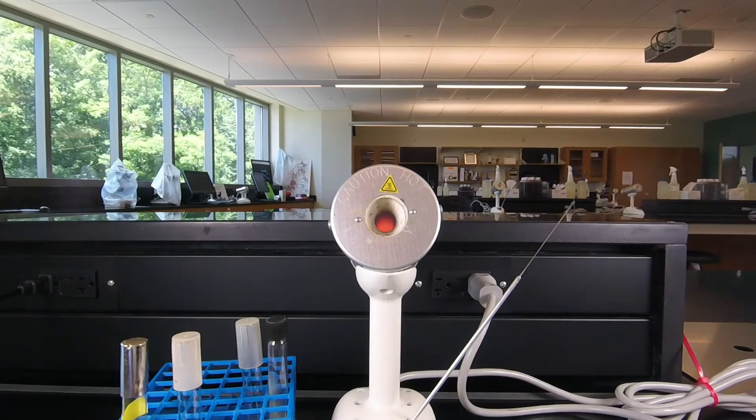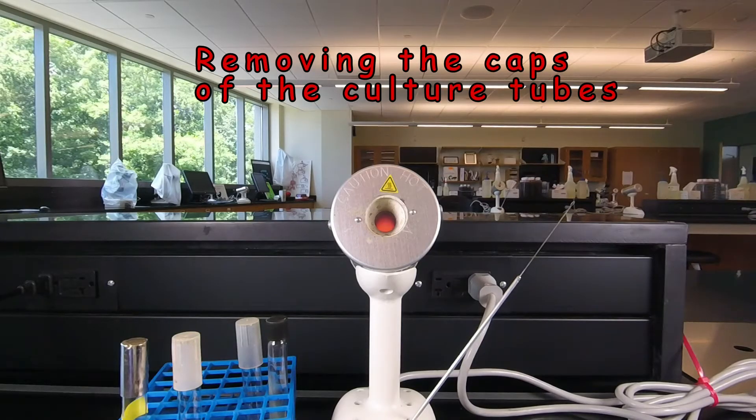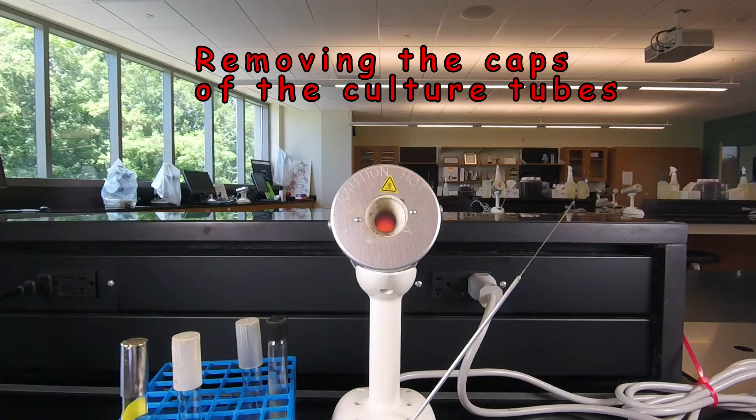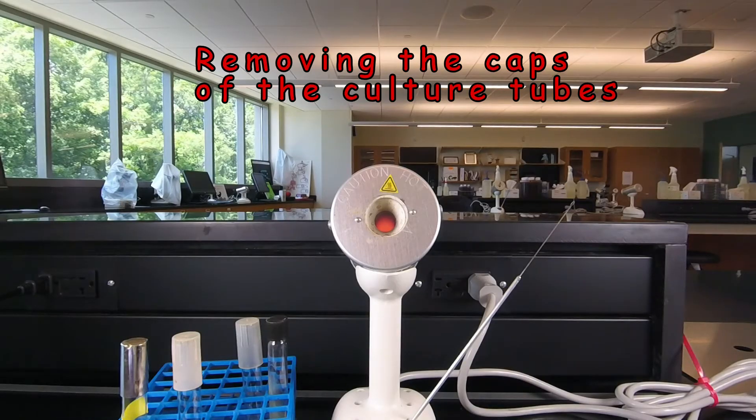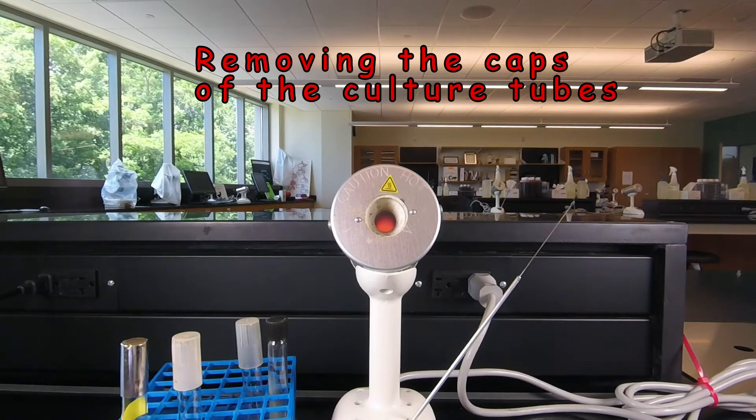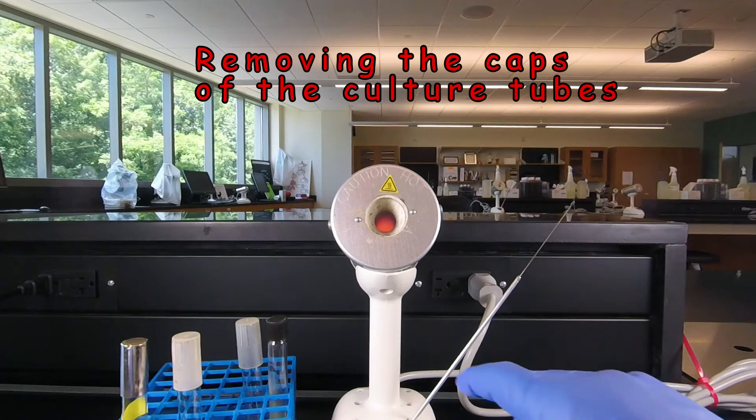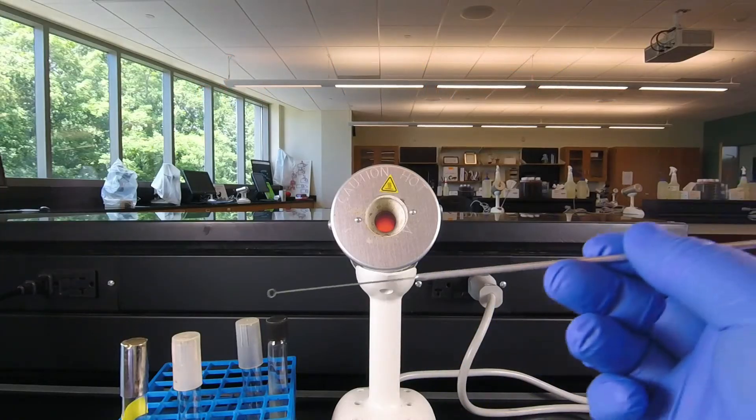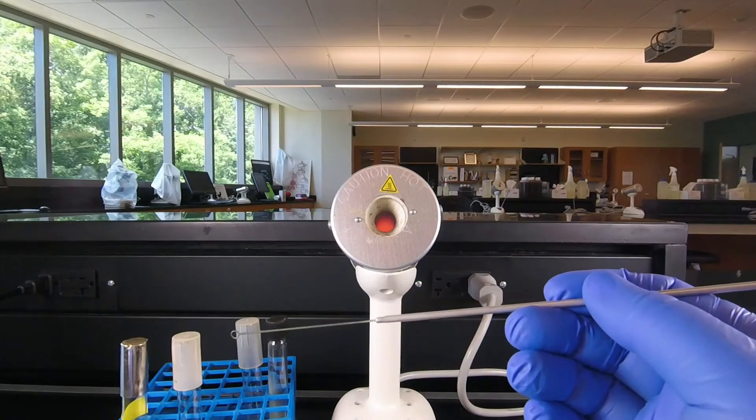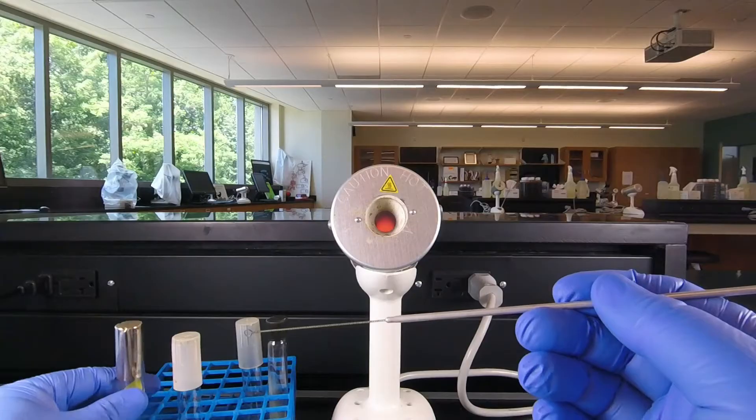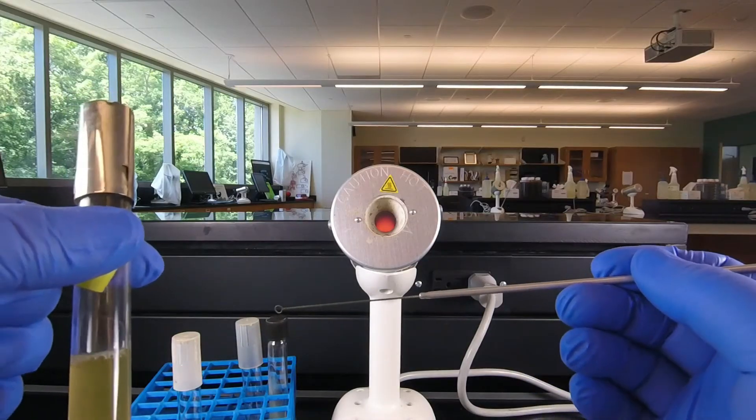Another important tip is how to remove the caps of the various culture tubes we're using to avoid contaminating the cap or contaminating the tube or the contents of the tube. When we do aseptic technique we're going to be holding the inoculating loop in our dominant hand and holding the tube that we're going to be using in our other hand.